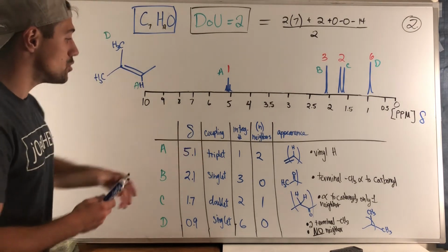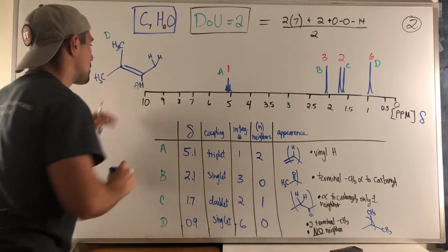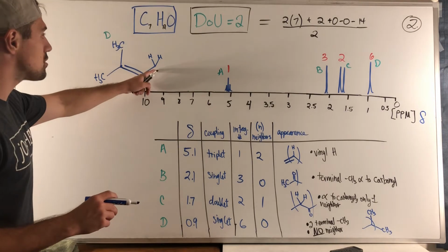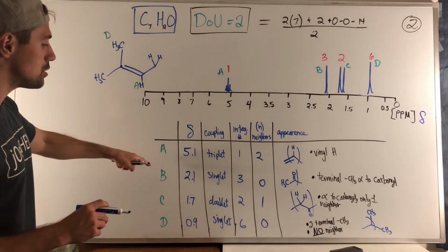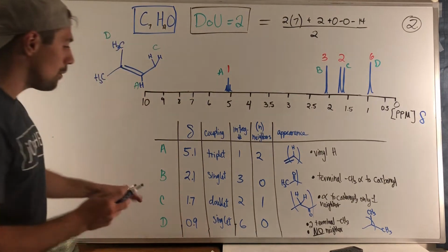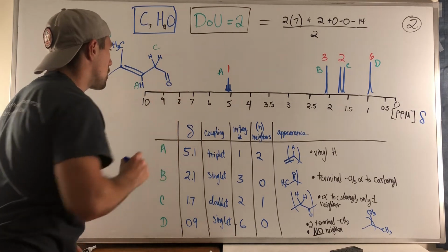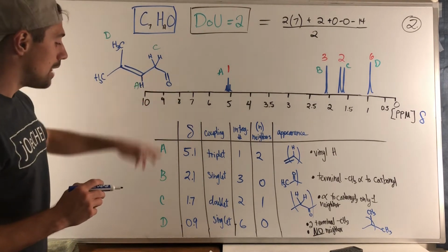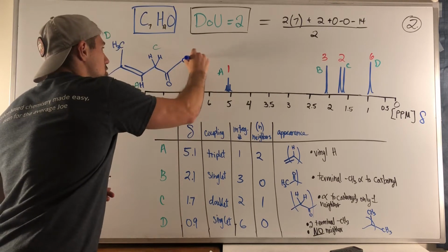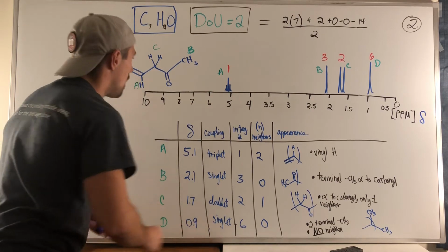Well, I have to have 2 neighbors, okay? The chemical shift is handled by the fact that this is a vinyl hydrogen. So if these are my 2 hydrogens, I see I have an integration of 2 for my peak C, and does that check out? Yes, as long as I then have this to go along with it. And then if I just tack on 1 more carbon, this is my CH3 that could be found for the peak of B.